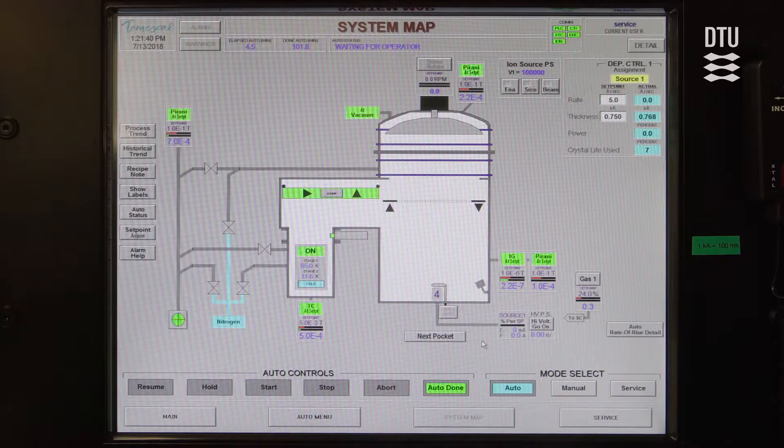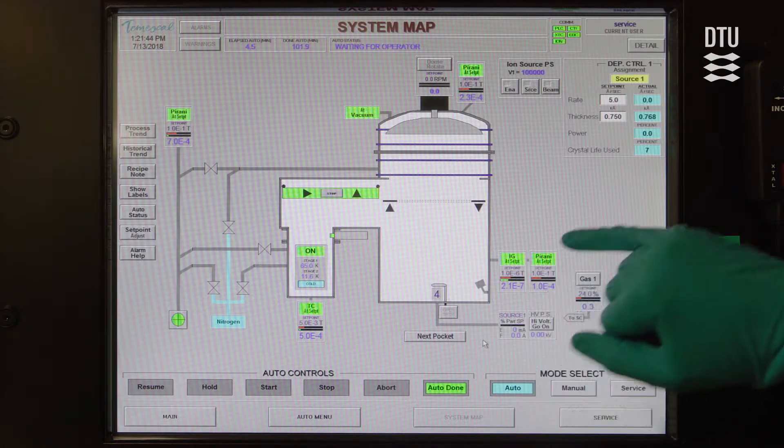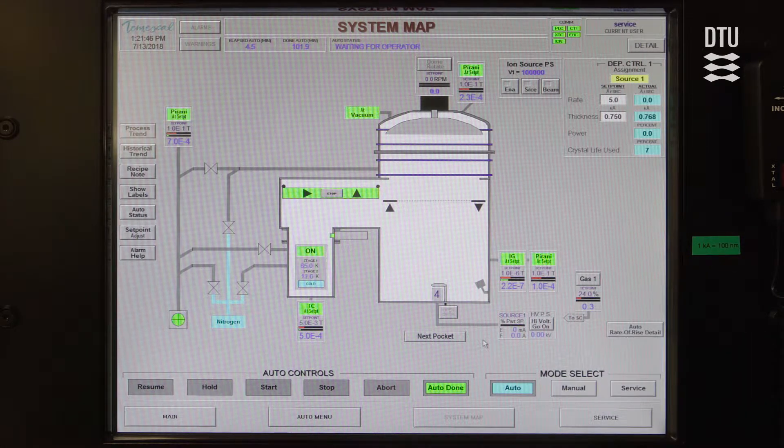Now we can see in the system map that the chamber has been cut down. We are actually at quite a low pressure, 2 times 10 to the minus 7 torr.